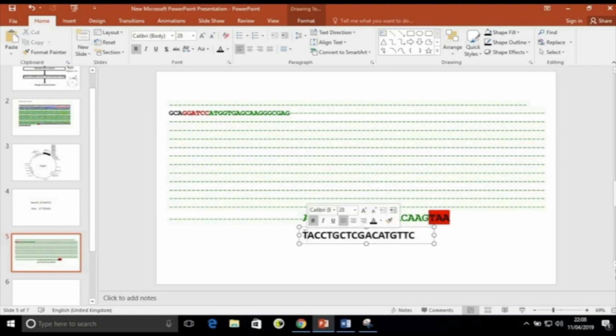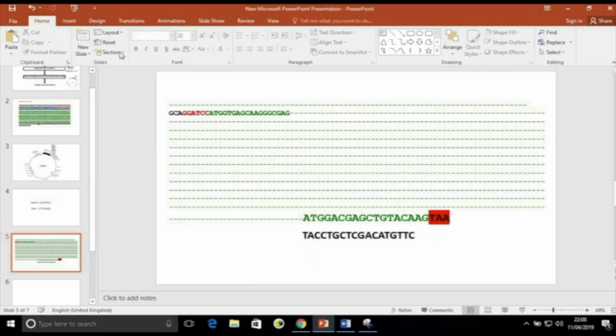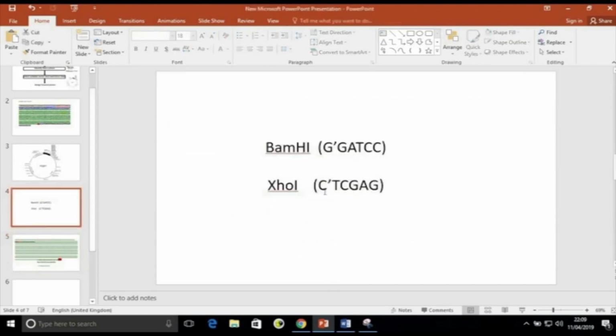So as you can see, this we have to keep from this direction, 5 prime to 3 prime. So I will take like this. So what we have to do is we want to insert a restriction site here. So we can insert a restriction site here directly. So in reverse primer we wanted to insert XhoI site.